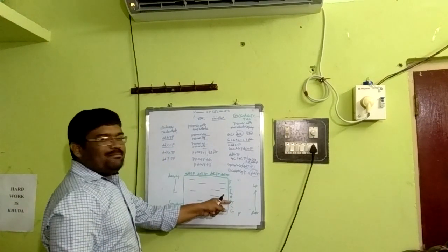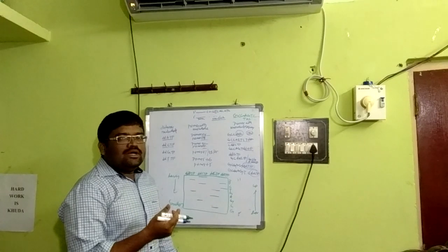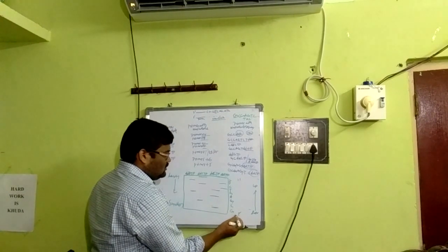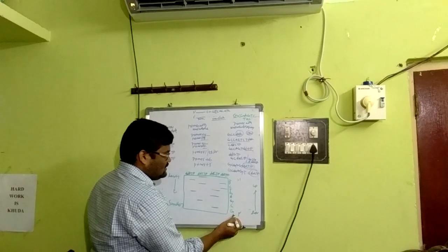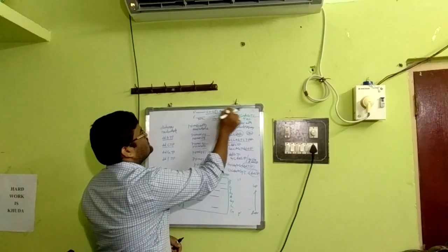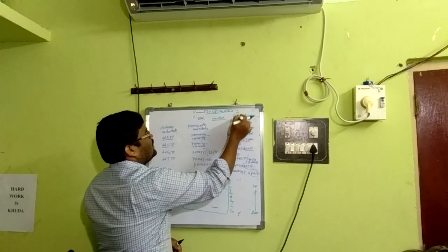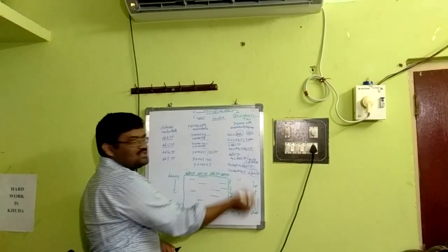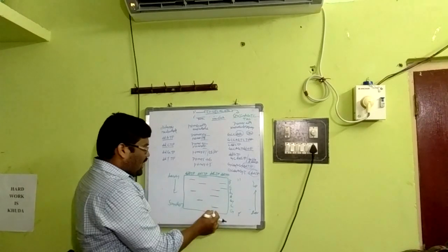That means it's a basic illustration of the banding pattern. That means it is complementary. This is what we call the strand. This is the exact determining sequence. With respect to the target sequence, it's complementary, and accordingly this will be here. From bottom to up, we have to study the different bands.